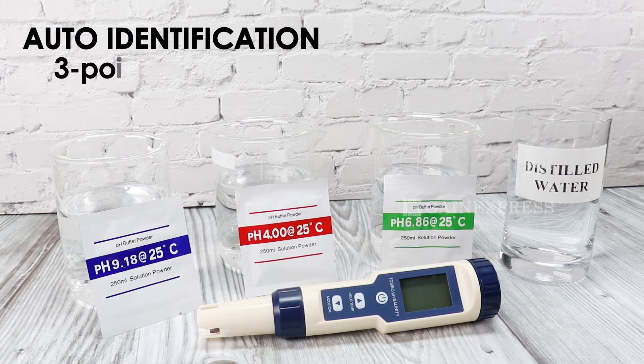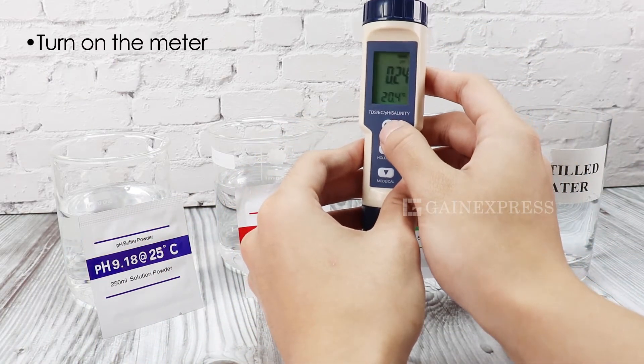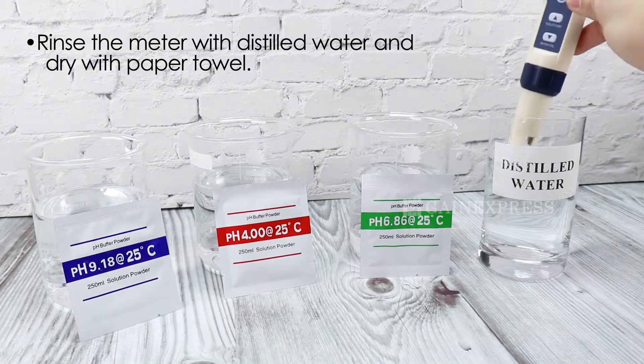This meter has three-point calibration and auto-identification. Turn on the meter, then rinse the electrode with distilled water and dry with a paper towel.